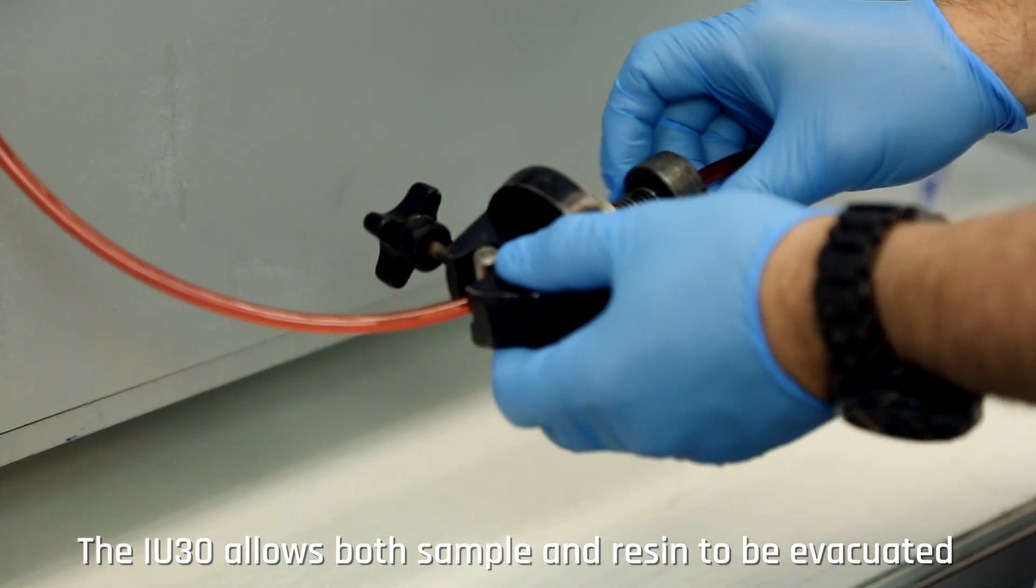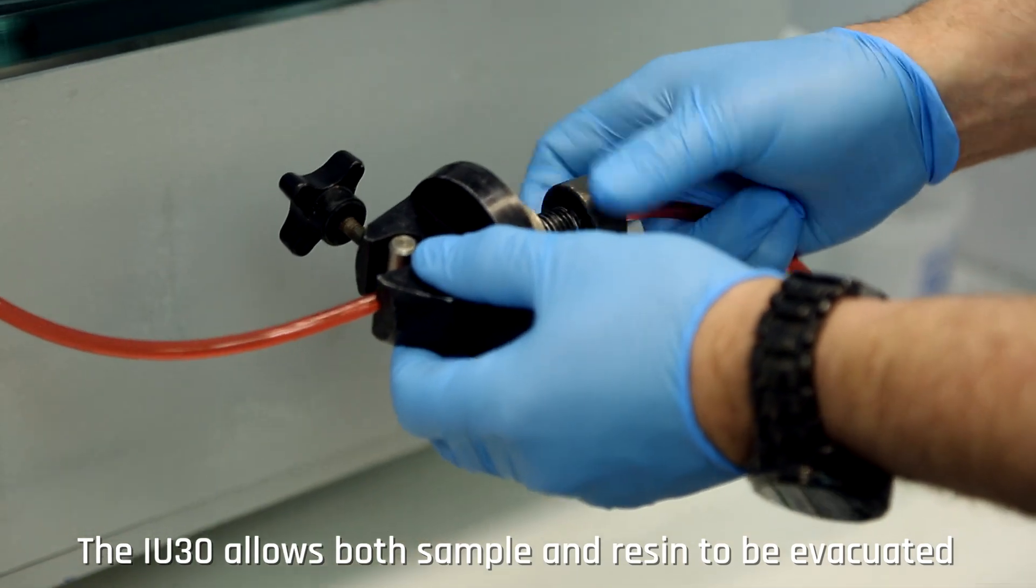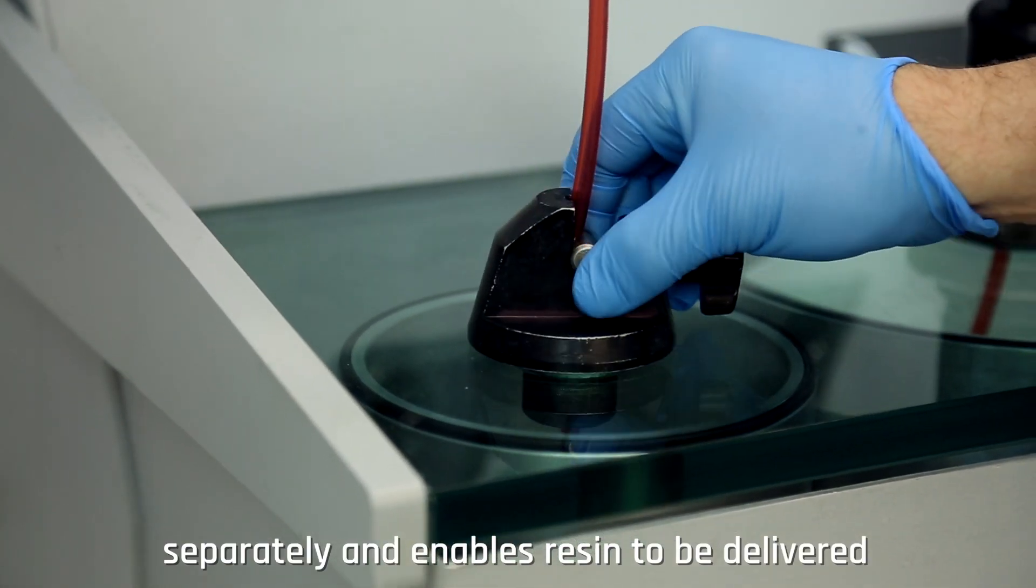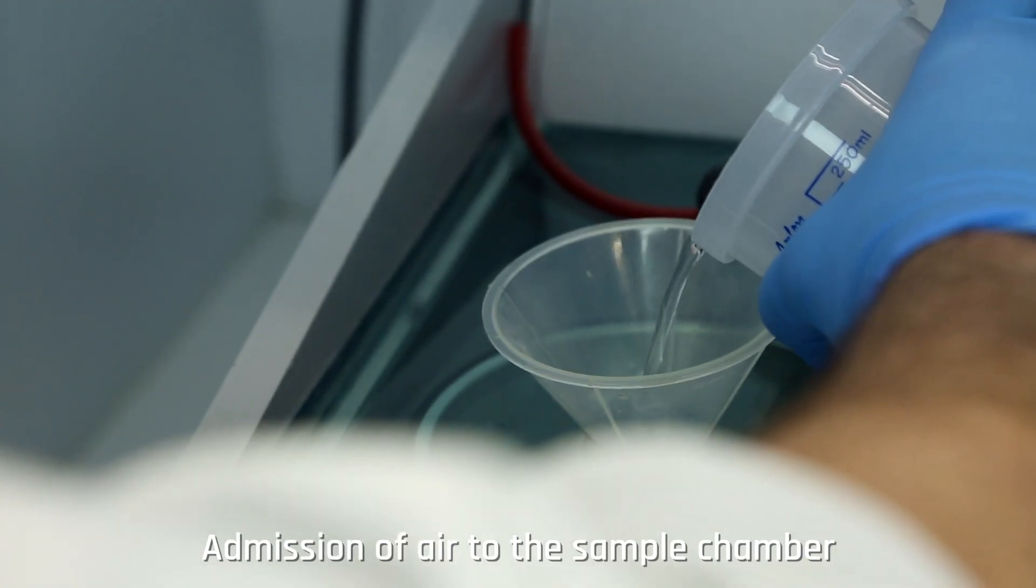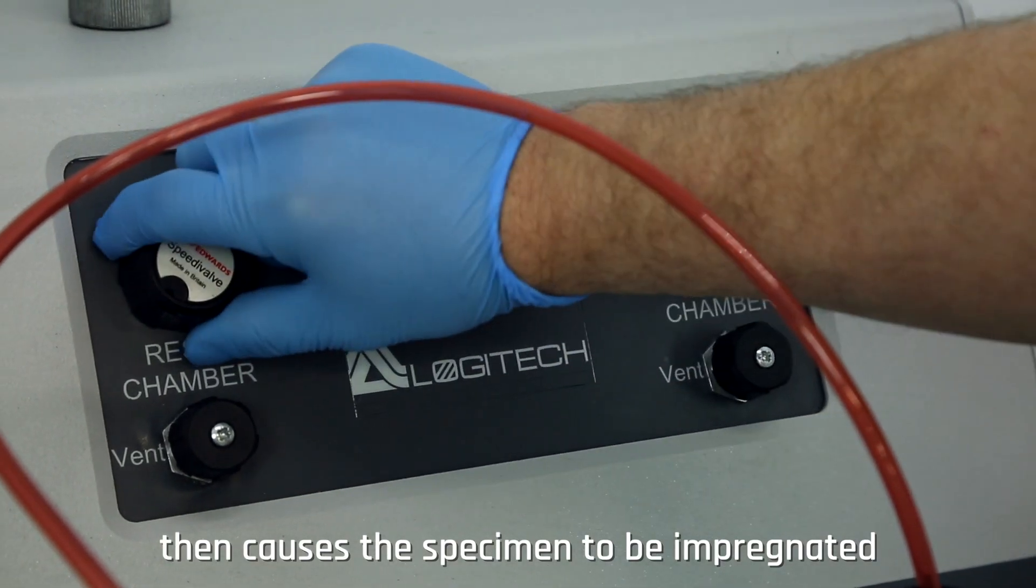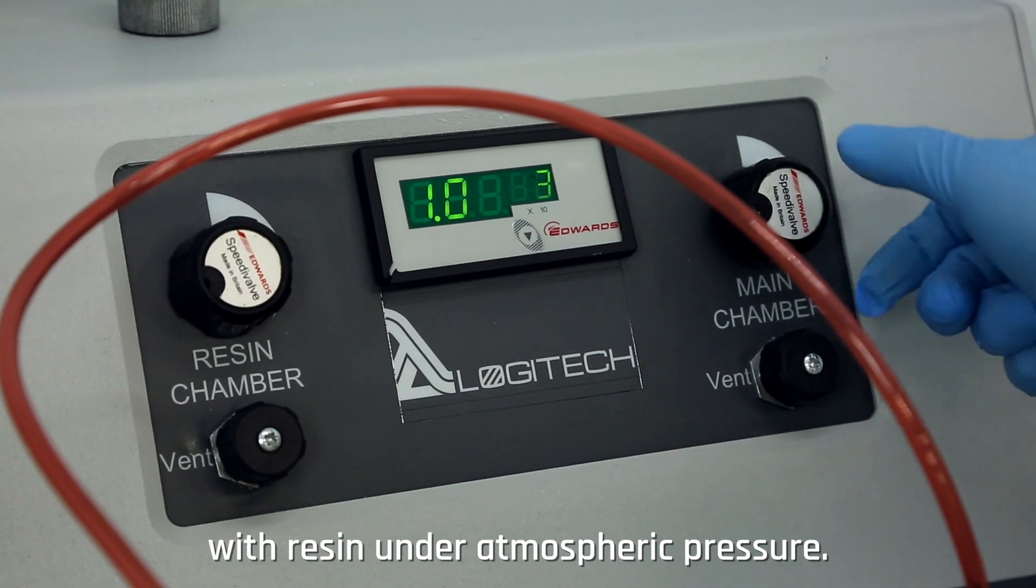The IU-30 allows both sample and resin to be evacuated separately and enables resin to be delivered to the sample while both remain under vacuum. Admission of air to the sample chamber then causes the specimen to be impregnated with resin under atmospheric pressure.